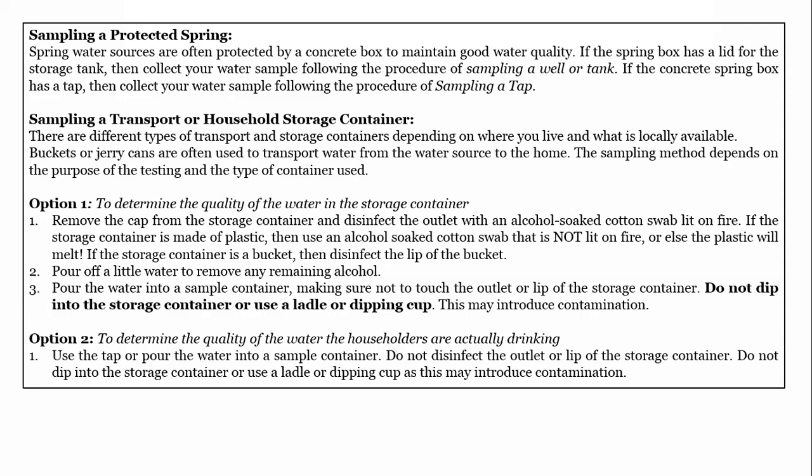So now, how to sample a household water container. Every day in your house, you have a bucket, which you maybe drink water from, a drinking bucket, and you need to sample water from it.